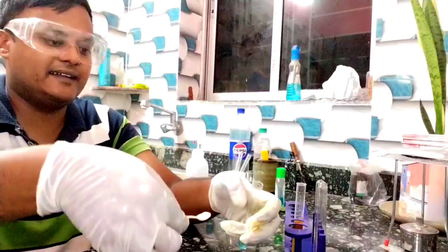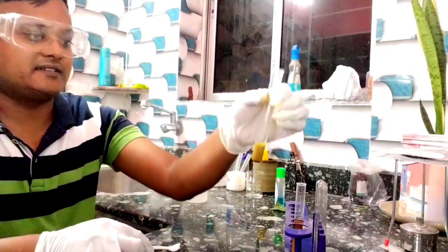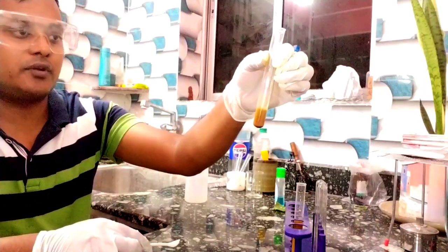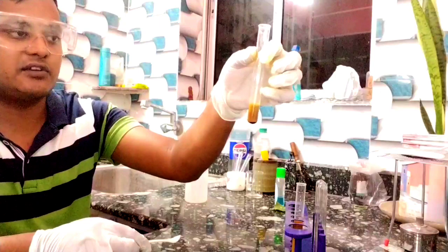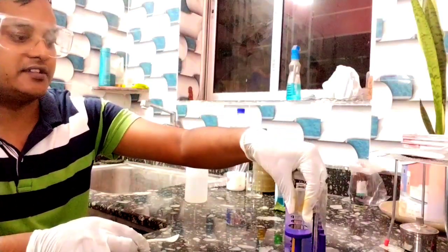See, directly adding the KI, potassium iodide. See, same observation. And now it is a brown color, a hazy solution. Just keep it for some time. You'll see the change.